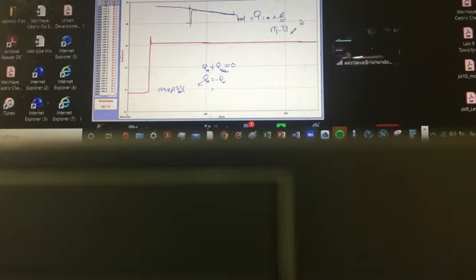So the initial temperature of the metal, it's a hot metal, so therefore, what was the temperature? 90.3. Because the metal was heated inside the boiling water. And remember that number, 90.3 Celsius. So that was the initial temperature for the metal. The final temperature is coming up, so that I don't know. Okay, so we're gonna wait.